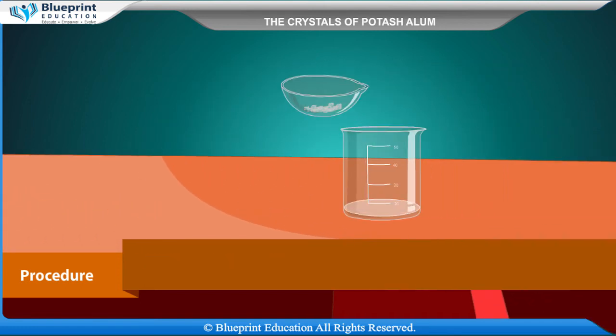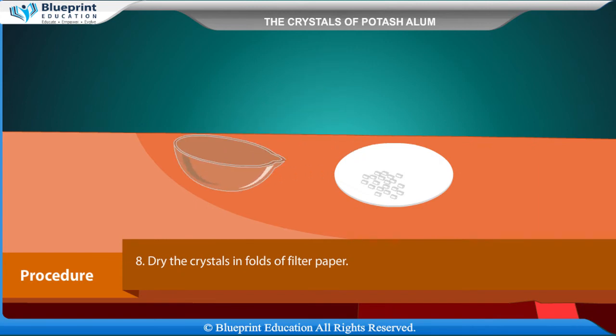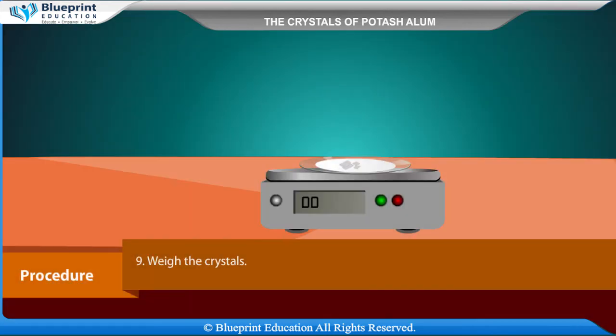Decant the mother liquor. Dry the crystals in folds of filter paper. Weigh the crystals.